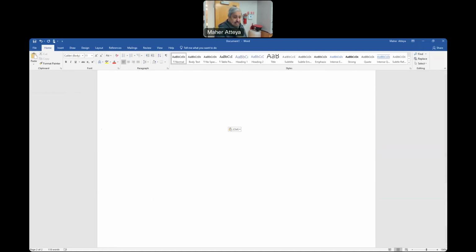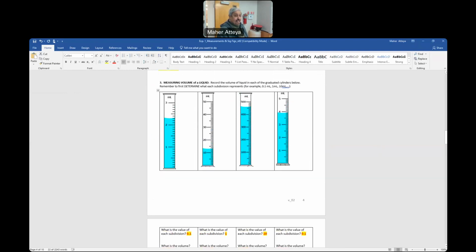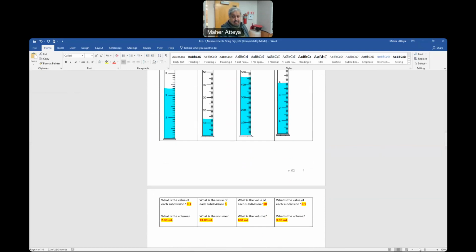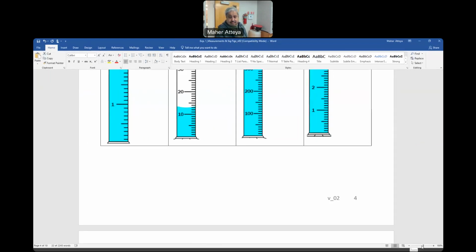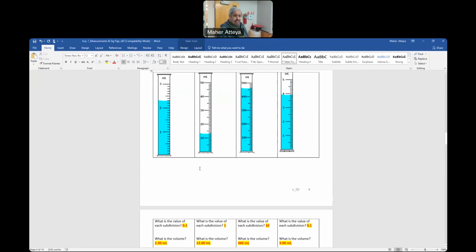So the next, you'll do it at home, not here. I want you to do the measurements and do everything at home. Then you come and make a copy of this. You don't have to do all this one here. So what you will do, I need to squeeze this one here into this, so I can make it smaller. Let me see, maybe smaller. I want to get this one up.